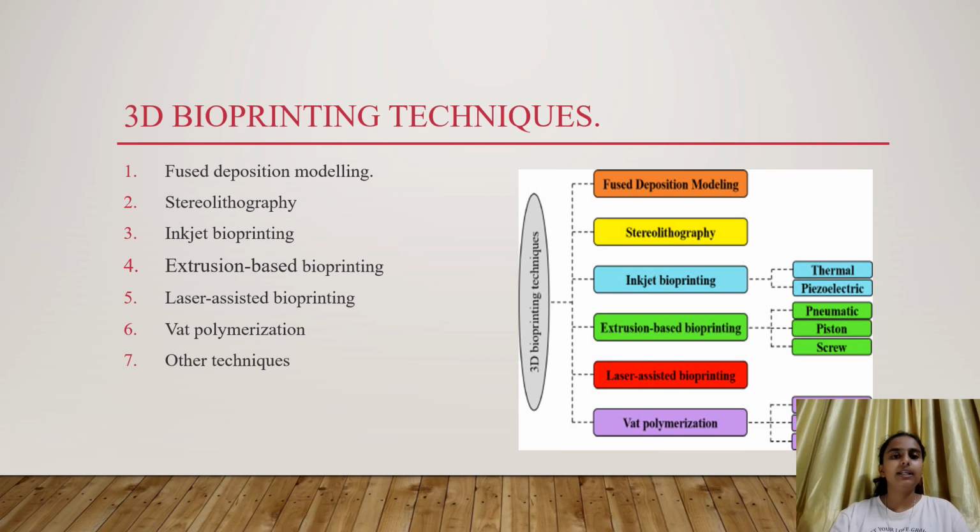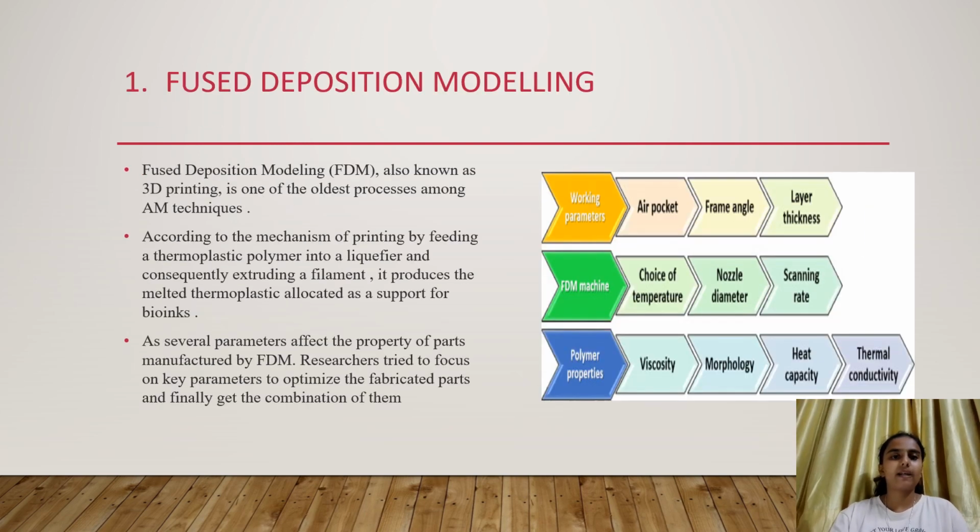Next one is 3D bioprinting techniques: fused deposition modeling, inkjet bioprinting, laser assisted bioprinting, and other techniques, VAT polymerization, extrusion based bioprinting. First one is fused deposition modeling.